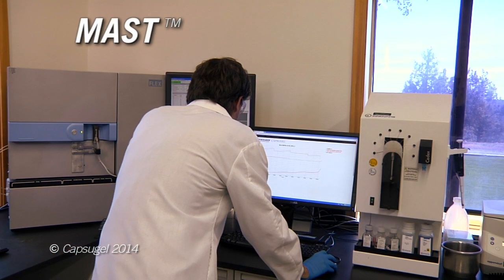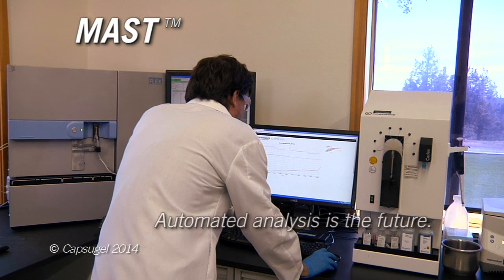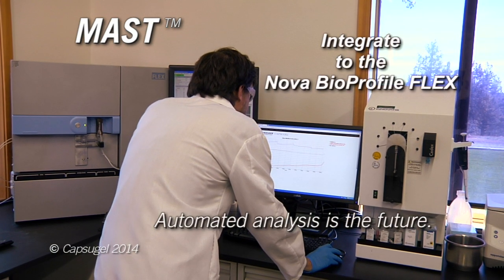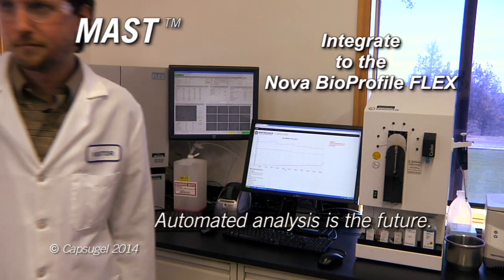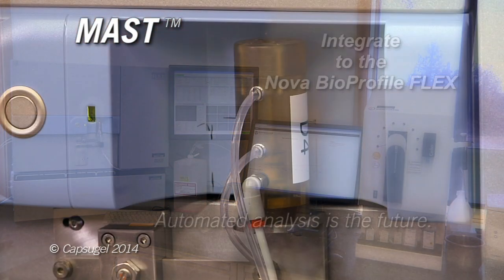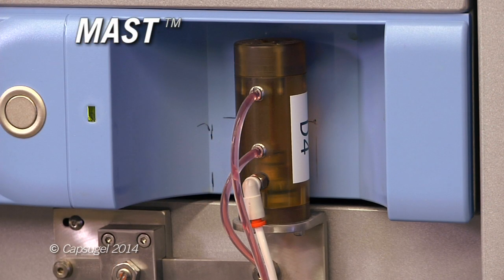The MAST system can be integrated to many different types of analytical devices. Routinely, the system is integrated with the NOVA BioProfile Flex. The MAST system bypasses the NOVA RVM and SPM units, presenting the sample directly to the NOVA.